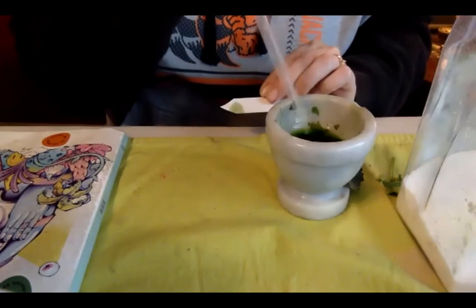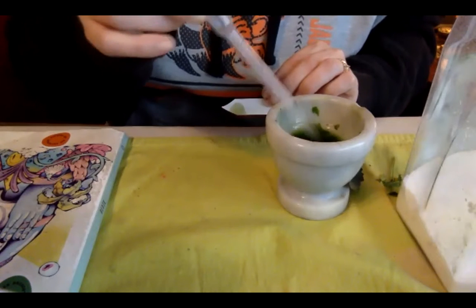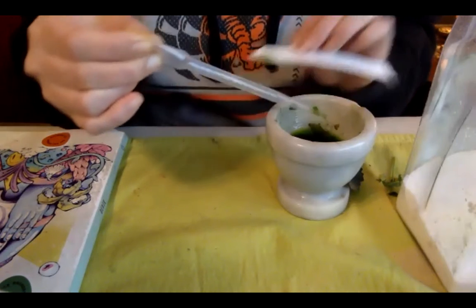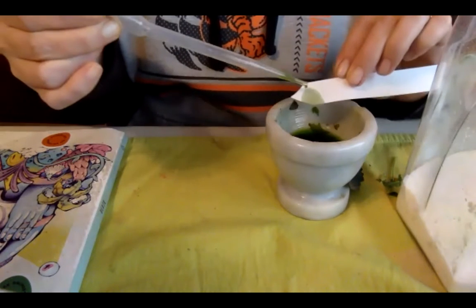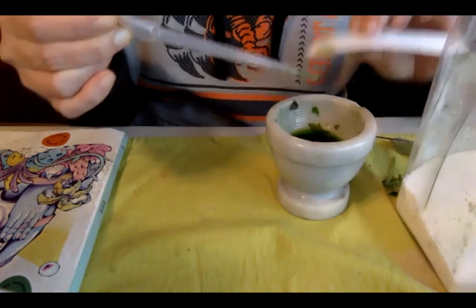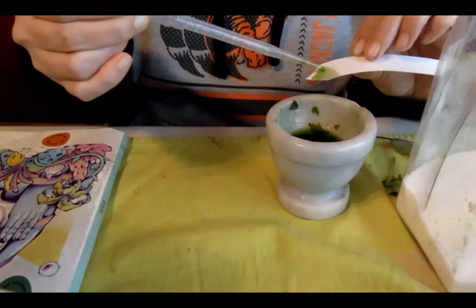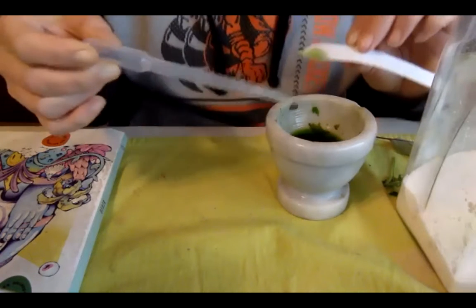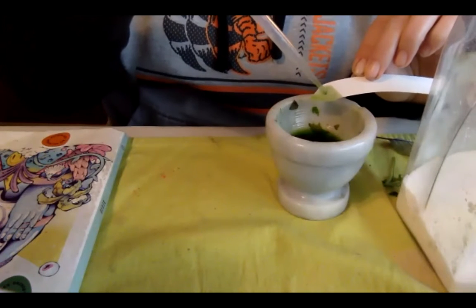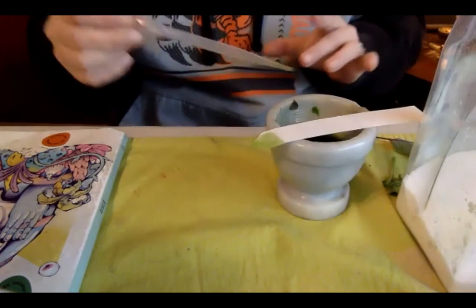Ideally I should filter this to separate out the solids, but it's not that big of a deal. It'll still work. Yeah, just completely graceless there, and it'll still work.